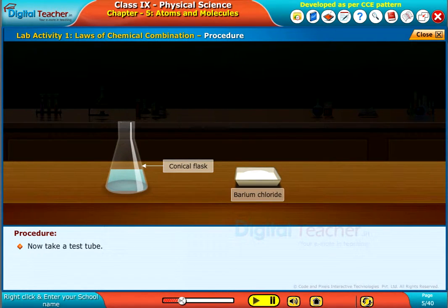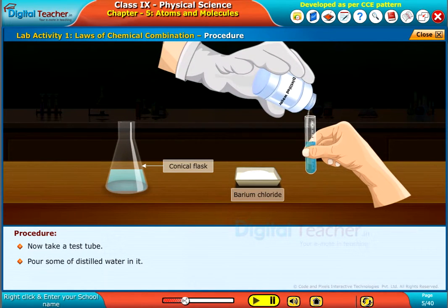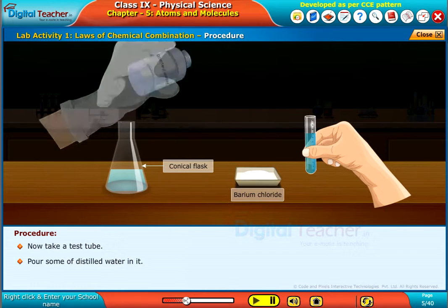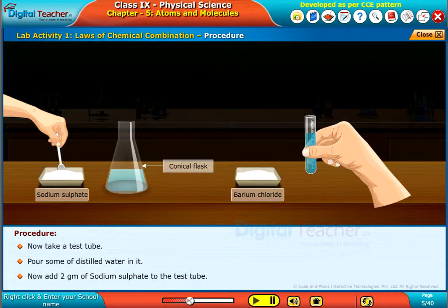Now take a test tube. Pour some distilled water in it. Now add 2 grams of sodium sulfate to the test tube.